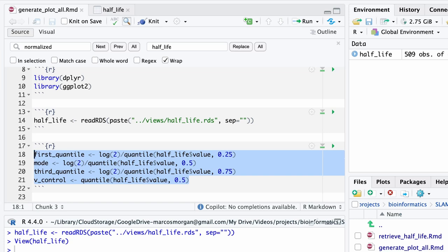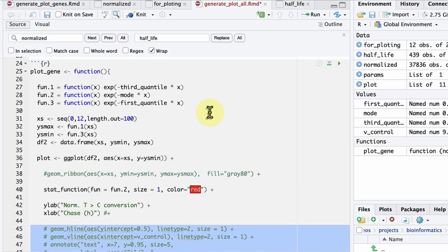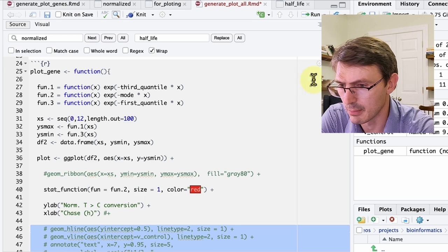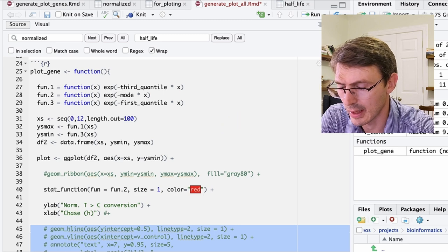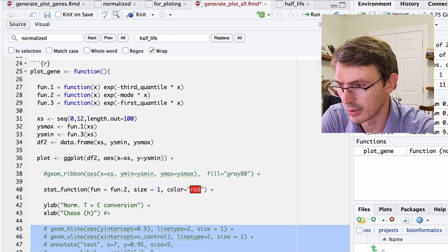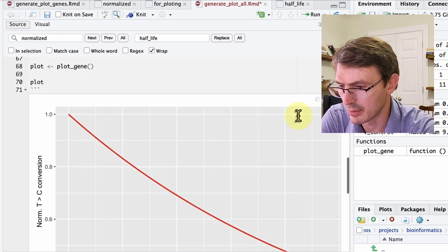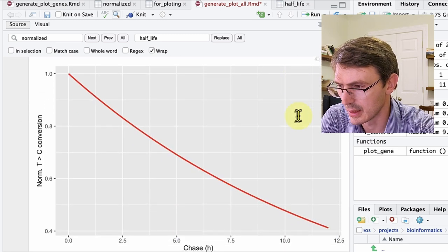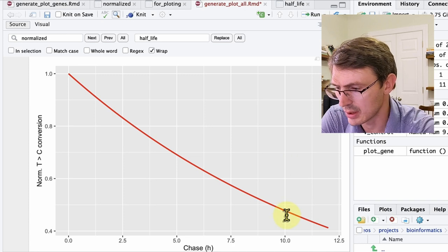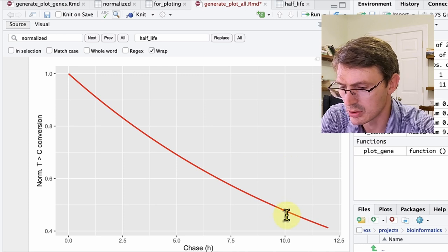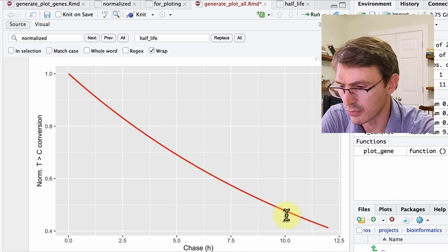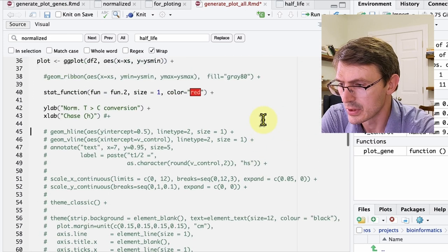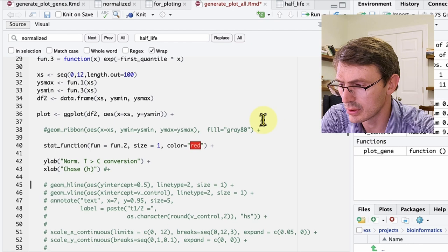In my previous video, we went through how to generate this table and how to get these k values. You can check the video using the link now on screen. We will use this plot function and we will start by plotting the mean half-life for the whole population. We do that. We have this decay curve, which is okay, but it's not very informative. We can do better.